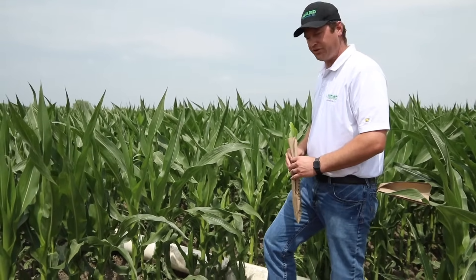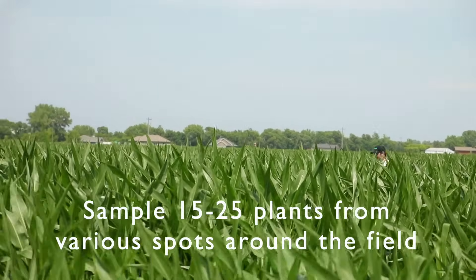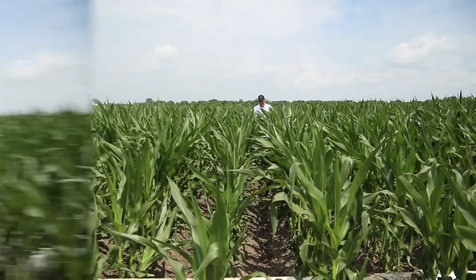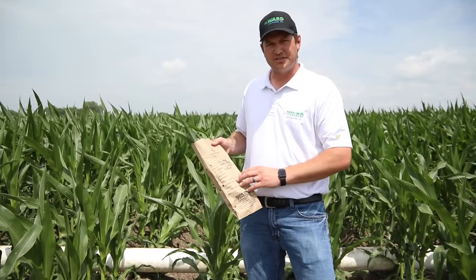We'll go take a few more samples here. We've got our fifteen leaves, we've got our information filled out in our sample bag, so it's time to head to the lab.